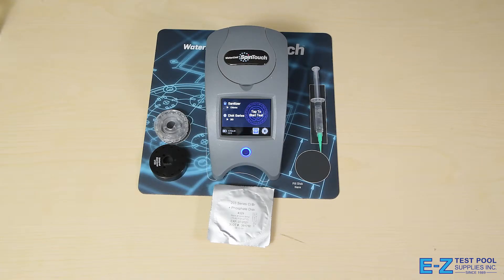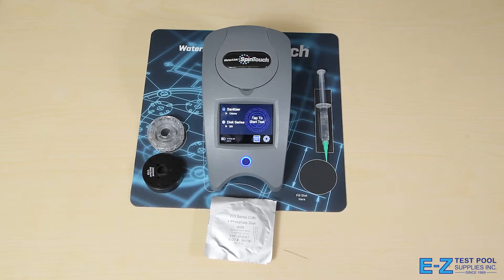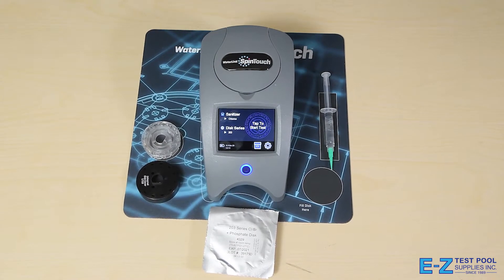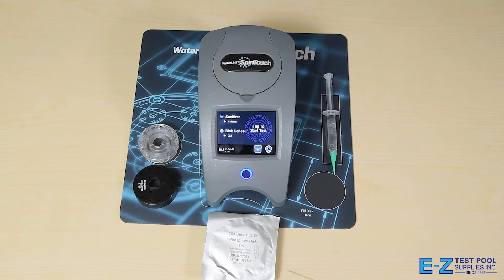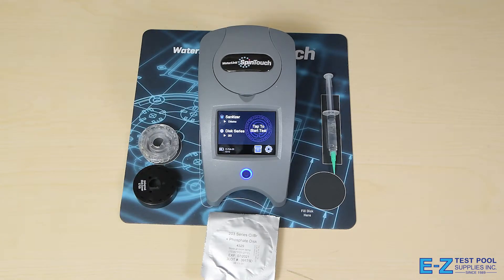So here we have the Waterlink SpinTouch machine. As you can see, there are no cords — it's completely battery powered, perfect for your service professional going out on any sort of commercial job and giving you unparalleled results on any sort of pool. I'll be showing you how to do a test today and then going over some of the options and features that are available on this.